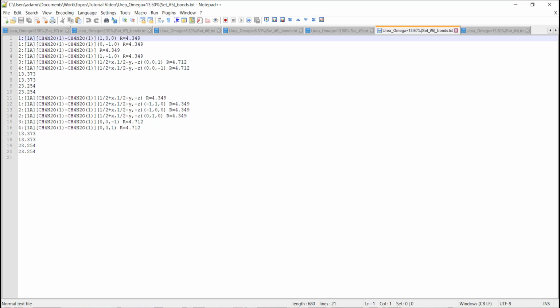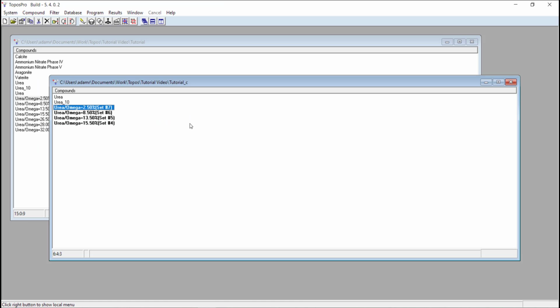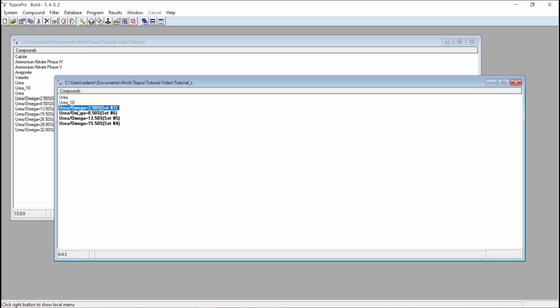So this approach is more of a shortcut. It's not something that can be used every single time, but it's a good way if you're starting to look at a new structure to see which minimum omegas are key for switching off certain bonding interactions.